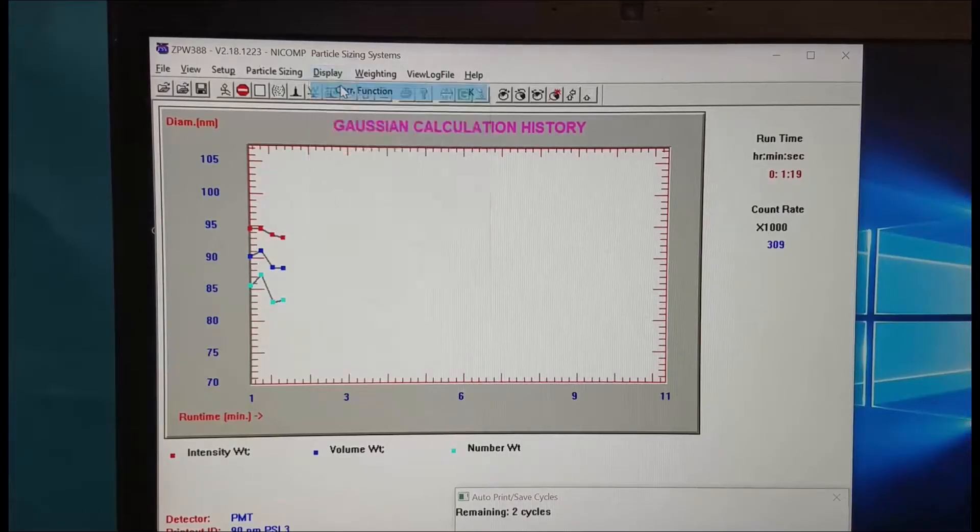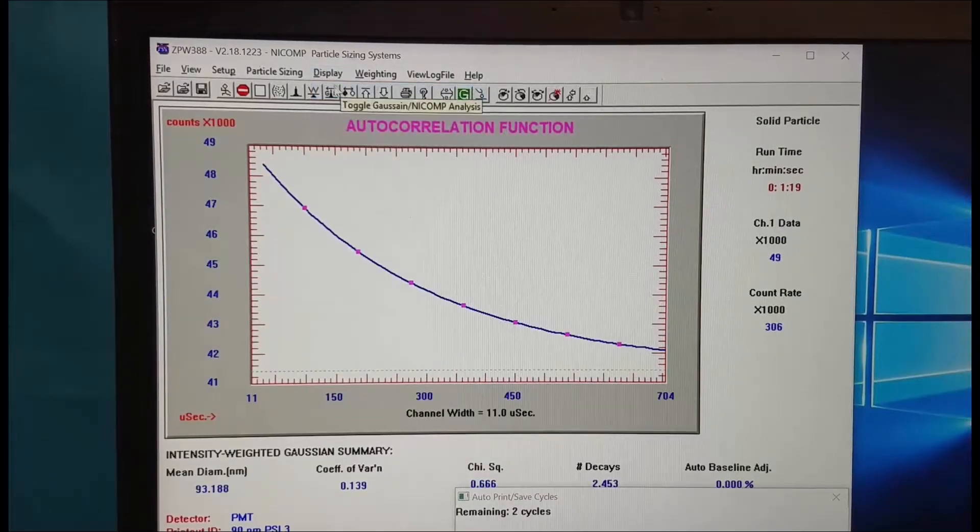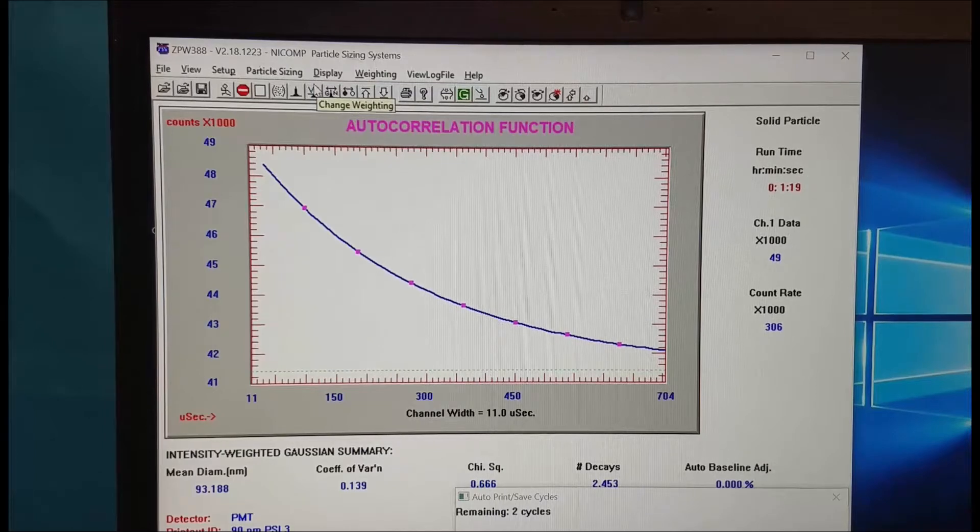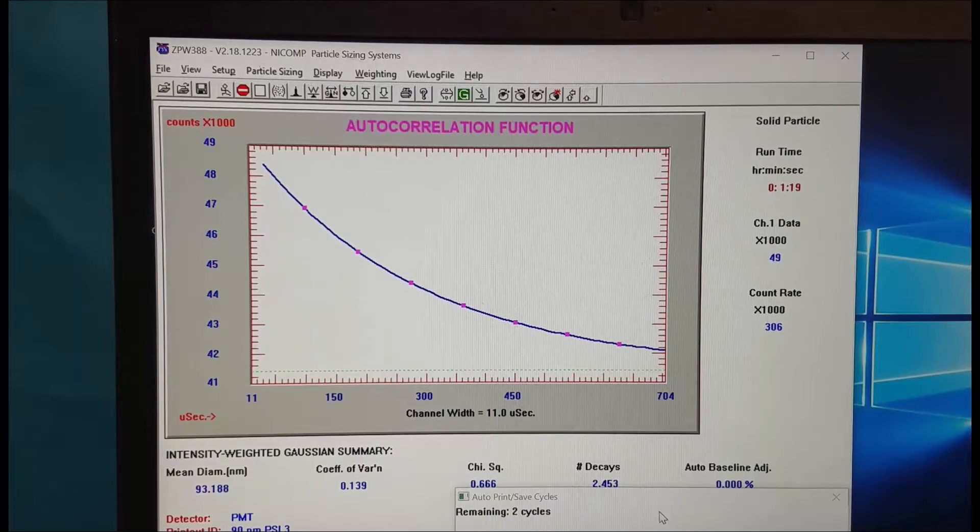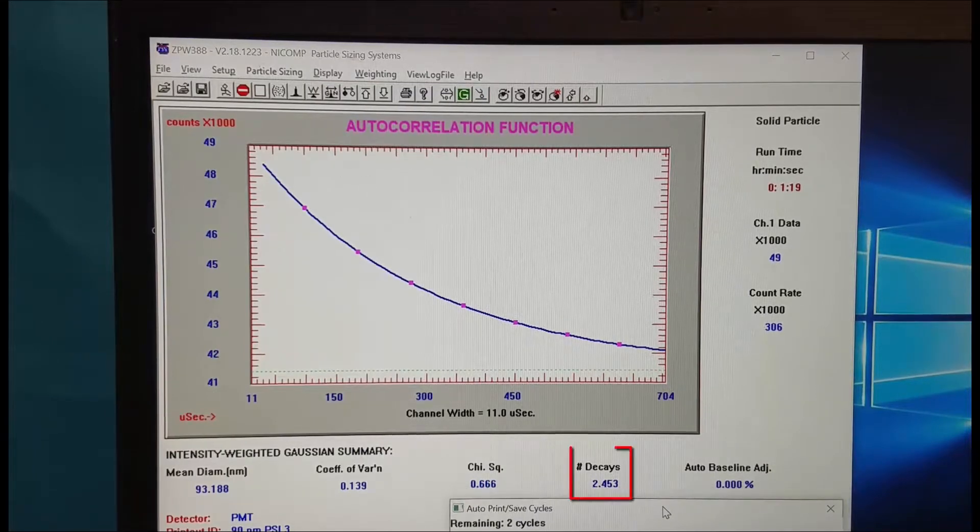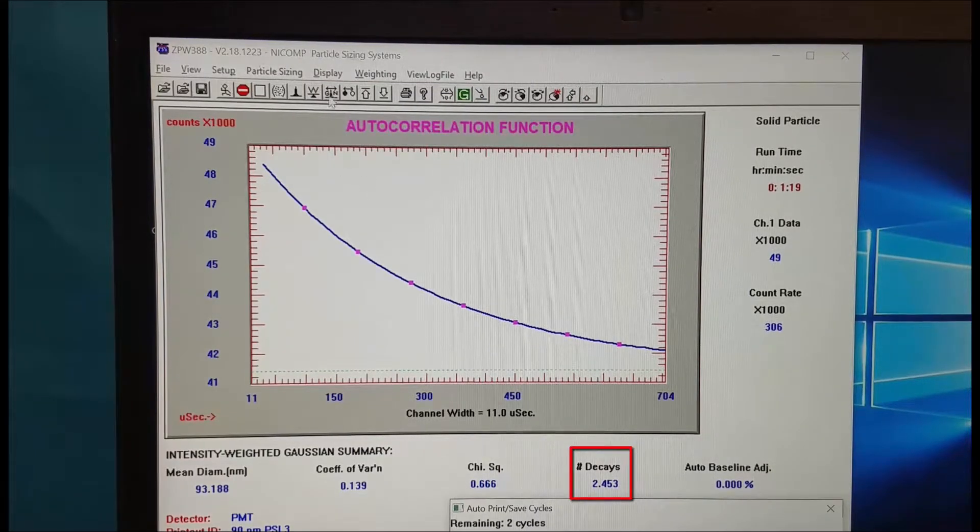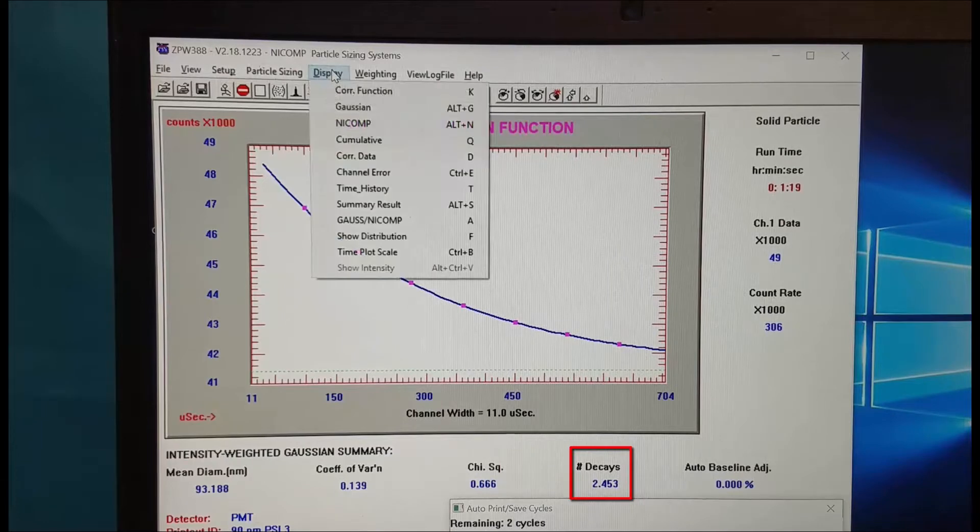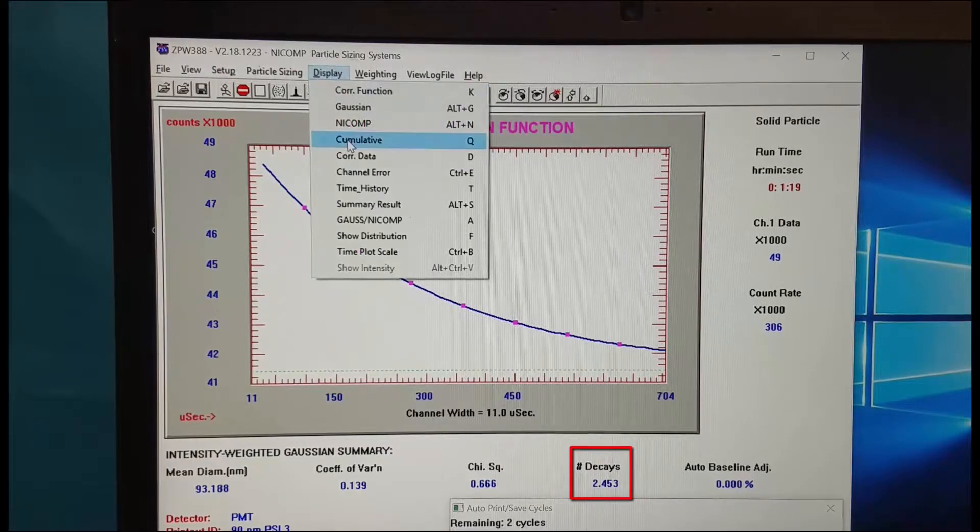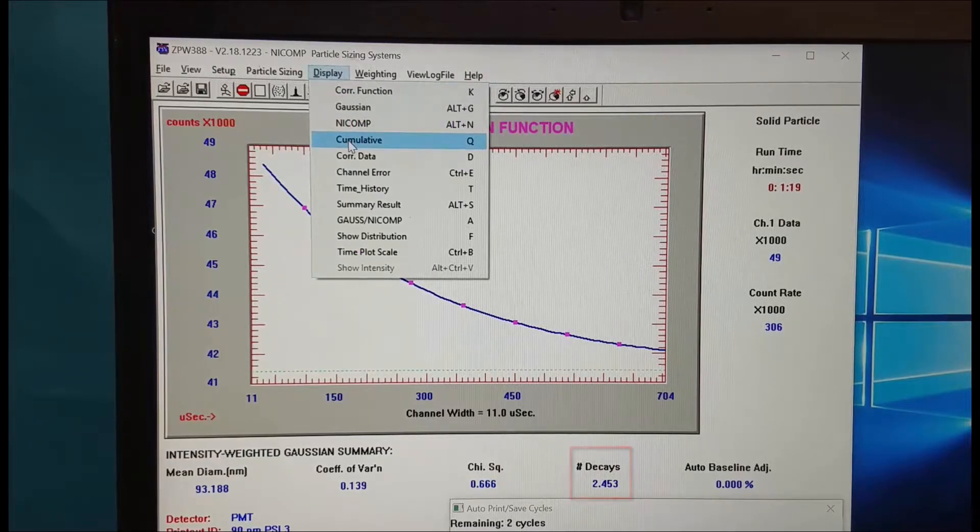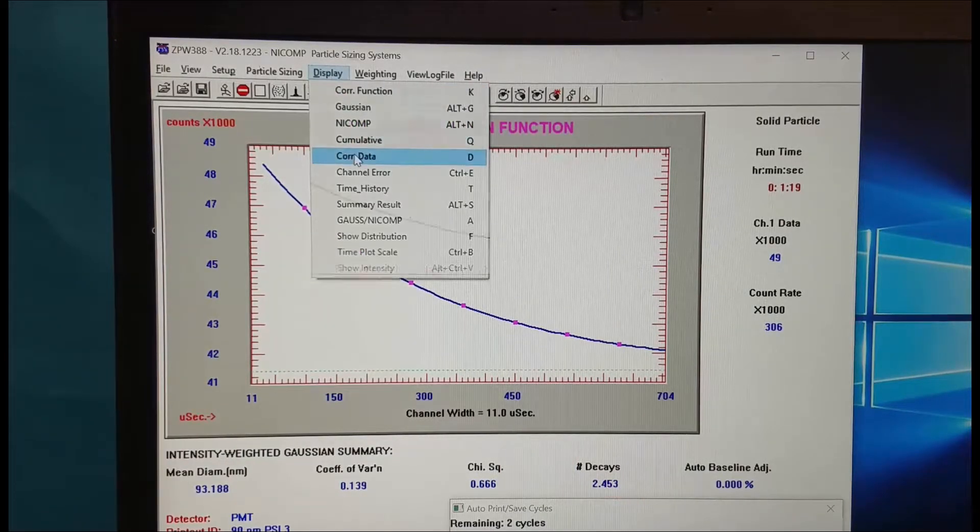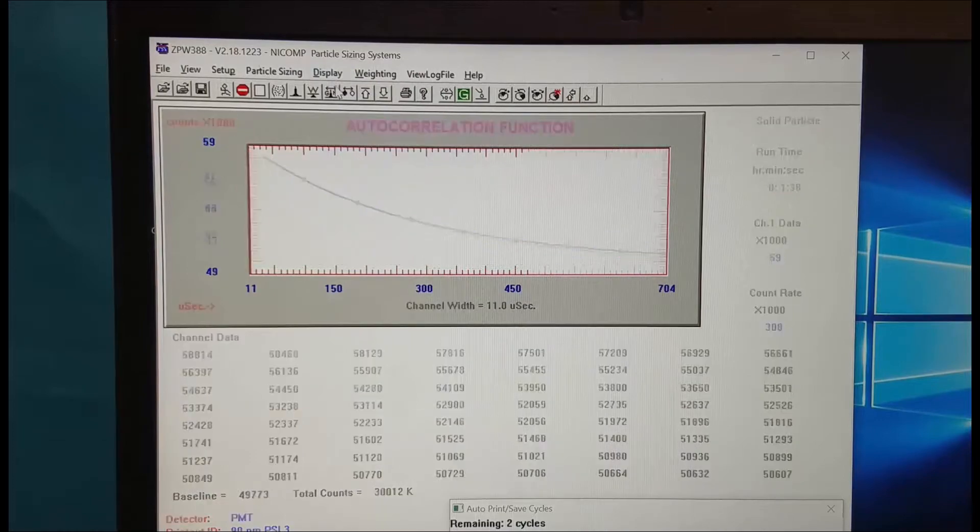While we're taking the measurement there are some other views we can look at. We can go to display correlation function. This is the raw data. We want to see underdecays around 2.5. We can come and look at the correlation data.